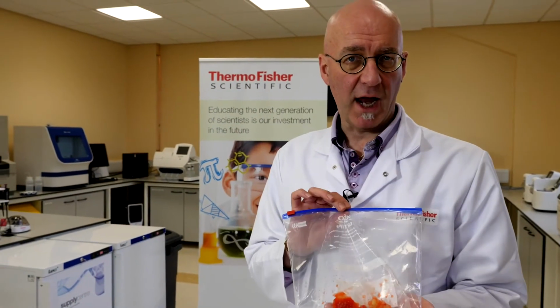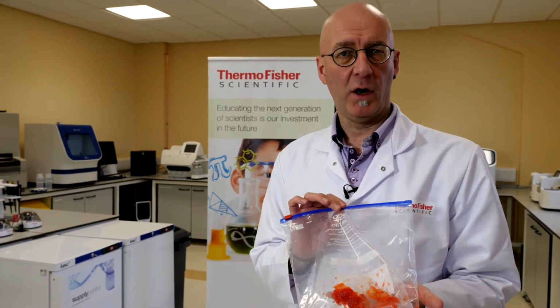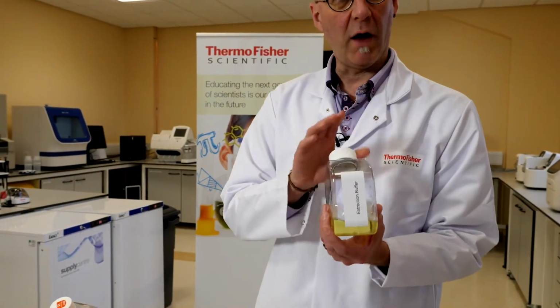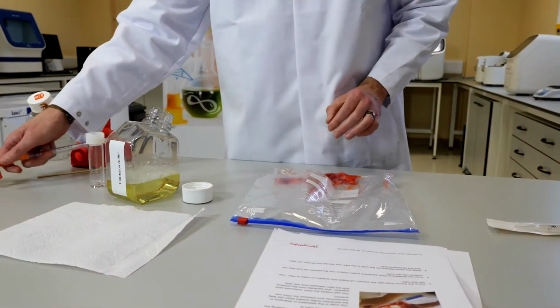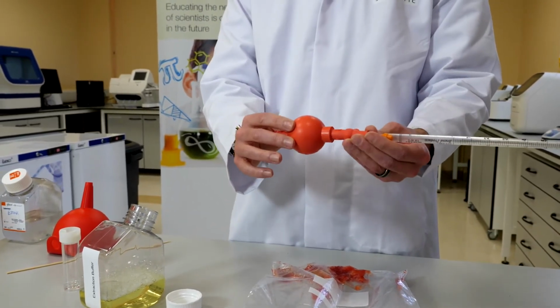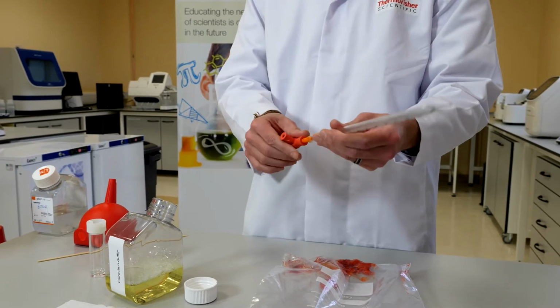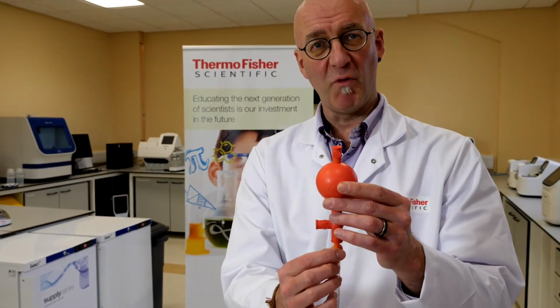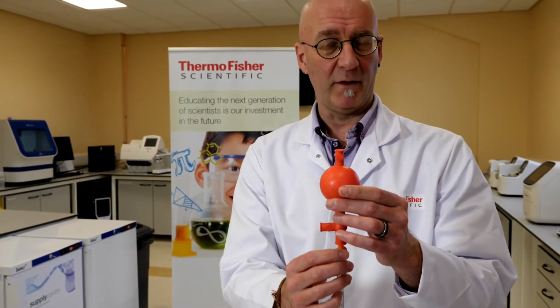What we're doing there is we're starting the process of extracting the DNA. In order to open up the nucleus and get that DNA out, we're going to have to use our extraction buffer. We need 10 milliliters of extraction buffer. So I'm going to take the pipette bulb that we talked about earlier on, and I've just placed it onto a pipette. There are 3 buttons that you will see here, and you need to do them in the right order, otherwise you're going to end up in a bit of a pickle.